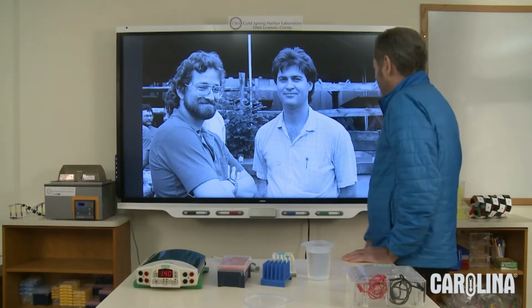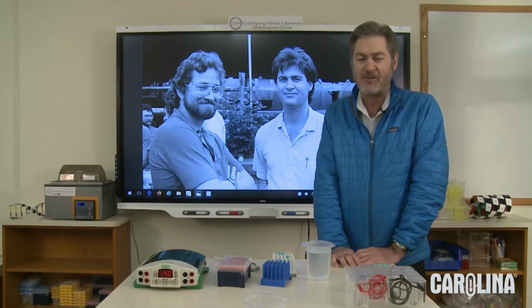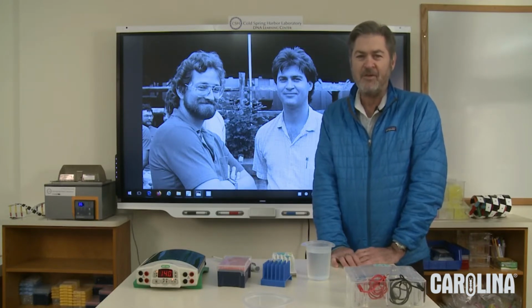I became interested in this experiment about 40 years ago when I was working at Cold Spring Harbor Laboratory, and I met this fella on the left who is a postdoctoral fellow named Greg Fryer. And he showed me the experiment that you'll do today, and I was astounded when I had the opportunity for the first time to see DNA and to understand how it behaves. You're going to do that same experiment today.